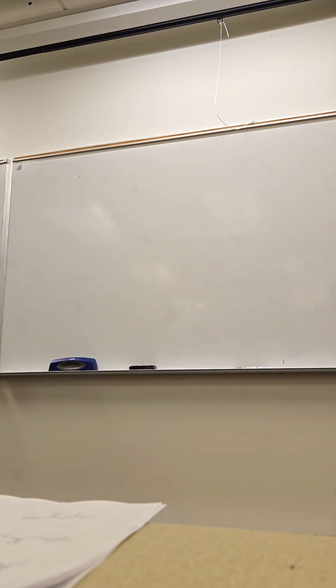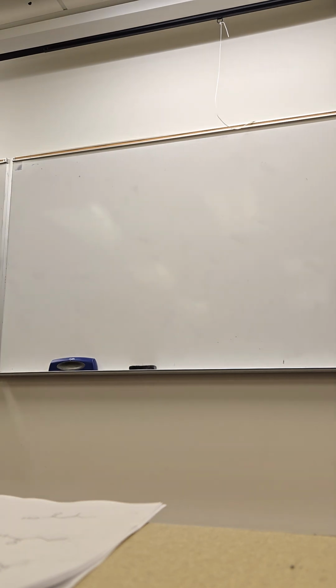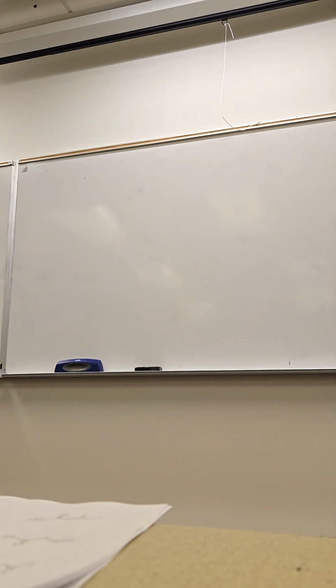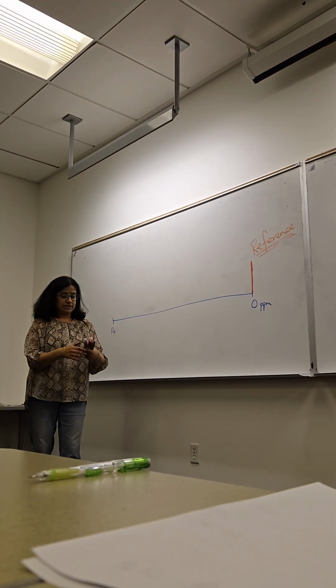Let's look at the handout I gave you guys. Just look at the proton NMR part of it. Let me give you some ranges where to expect signals, and then I'll give you an actual table, just like we did for IR yesterday.